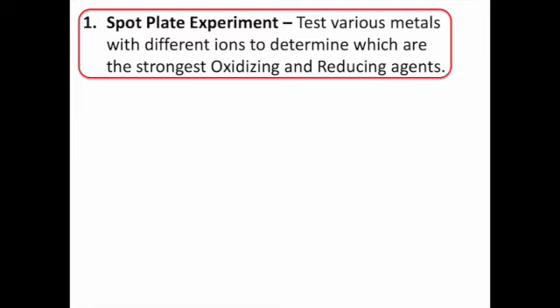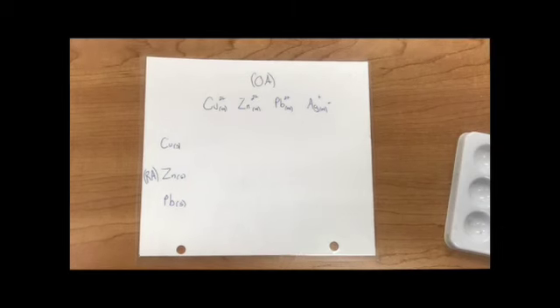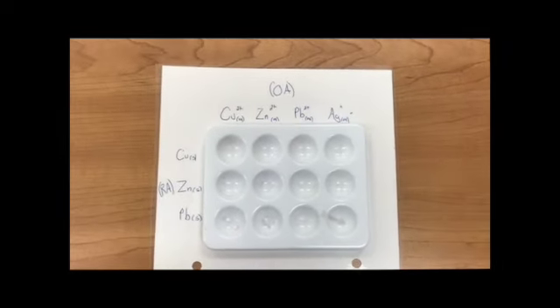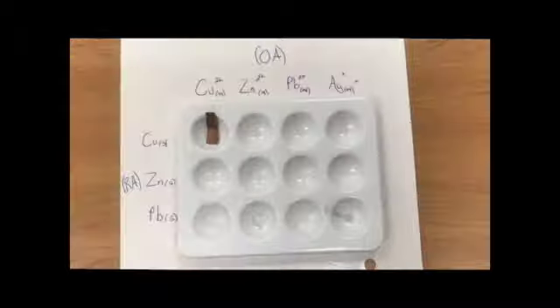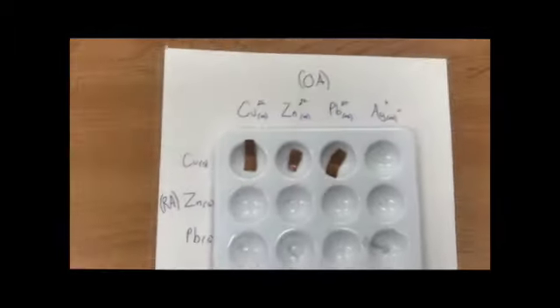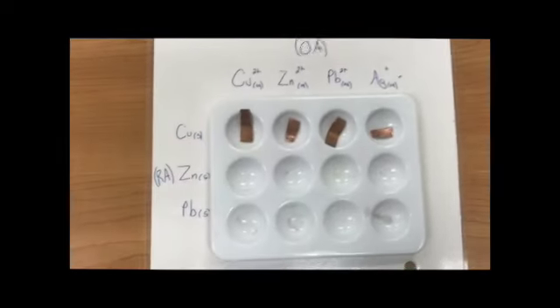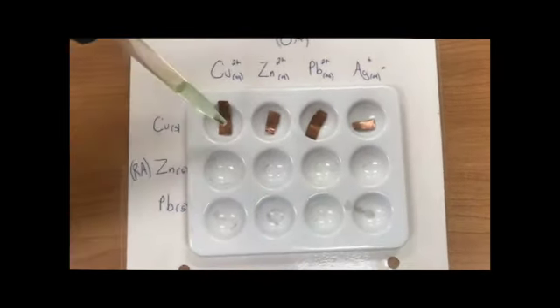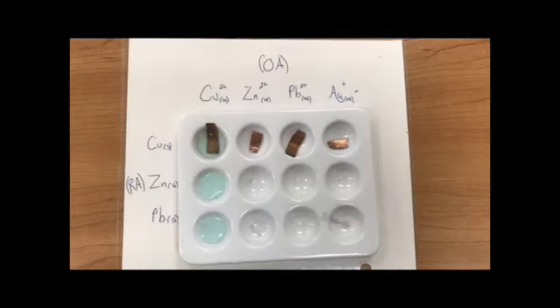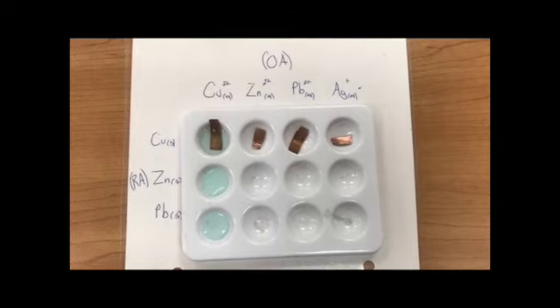and you'll be able to see me doing this with a few different metals and metallic ion solutions. So here's the video. What you see here is what's called a spot plate, and I'm about to add copper metal horizontally across the top, so that's why you see Cu solid there. And then vertically I'm going to add copper solution, copper 2 positive ions in solution all the way down, so you see those blue puddles.